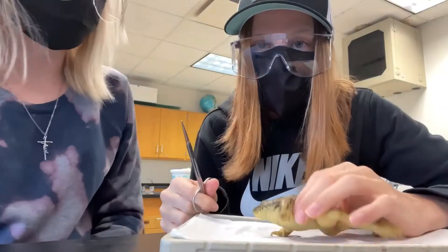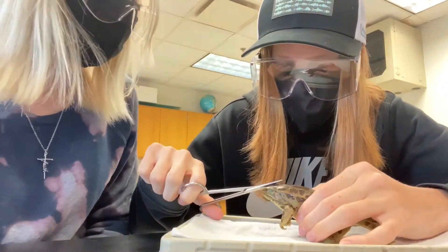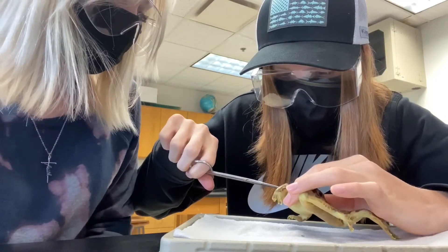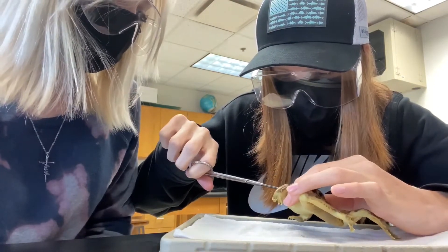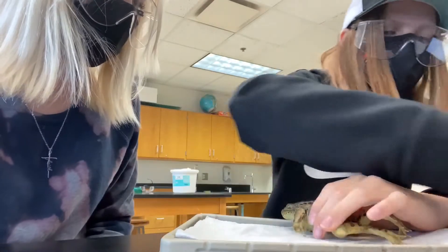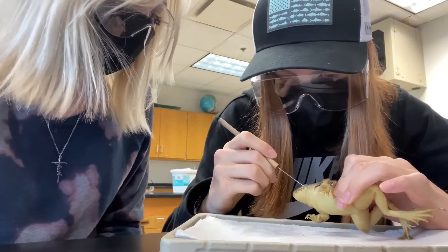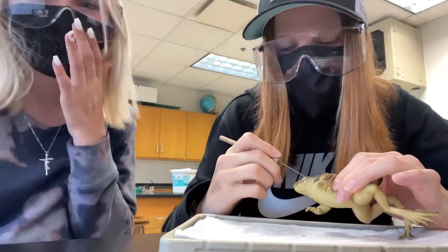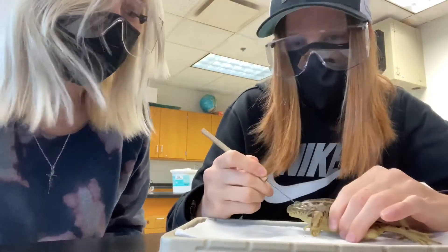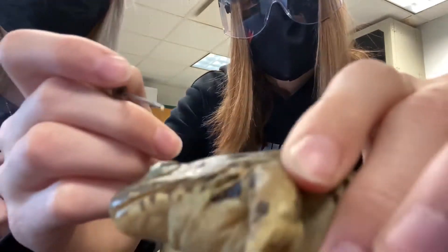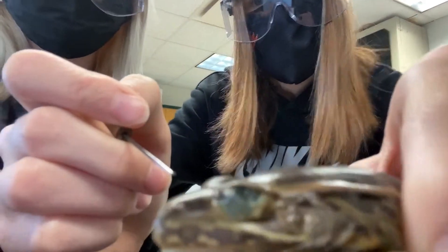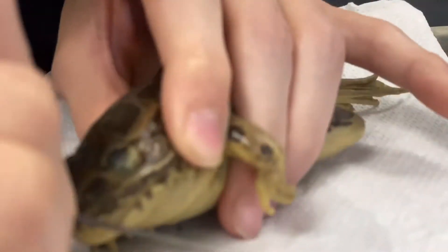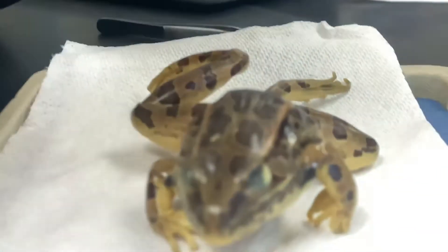Ladies and gentlemen, start your engines. You have to take them both out or just one of them? Just cut like that. Tiny slip. When you get the lens out, I want it. This is so tough. You just stabbed the eye — it's going to break. Look at that. We're trying to get the eye out. Looks like we're getting stuck. I think we're going to need to get the scissors out.